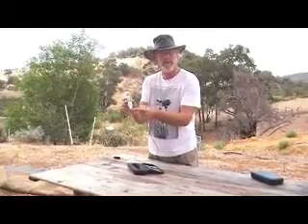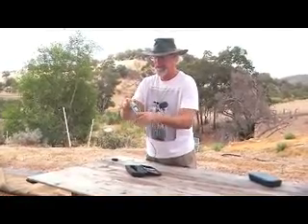It has probes at the bottom there. It has a set of batteries on the top.